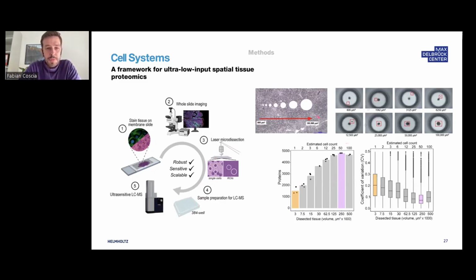The work that we did here mostly focused on liver tissue FFPE samples, which allows us to very consistently analyze samples over serial tissue sections. This tissue type is mostly comprised of hepatocytes, so we can be a little bit more certain that what we measure here is due to distinct profiles of hepatocytes, which make up around 60 to 70% of the liver cell mass.